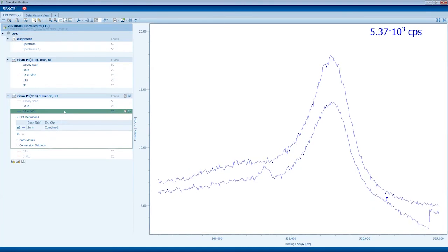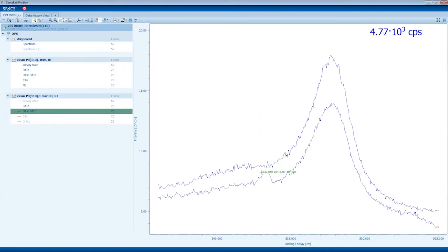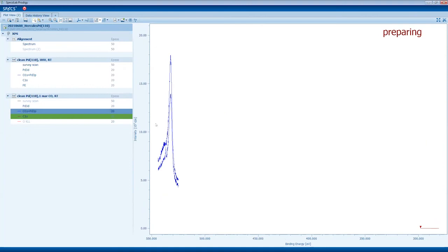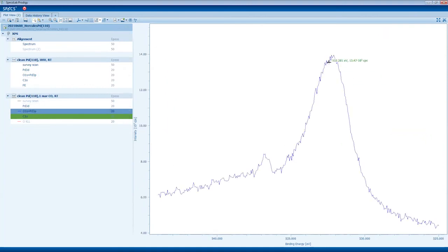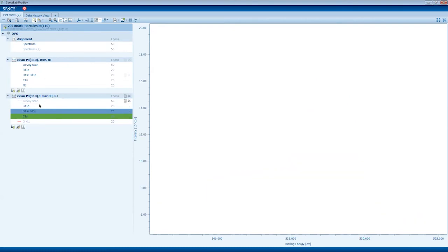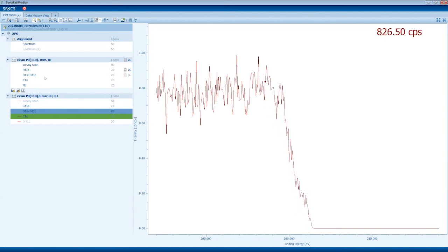So now you can see, if you look here, this small peak comes from the gas phase. And there is also some adsorbed CO. However, as it overlaps with palladium, it is quite difficult to say, but after you again normalize it, maybe here will be some asymmetry. The proper analysis by fitting would reveal it, and then you can subtract the palladium.